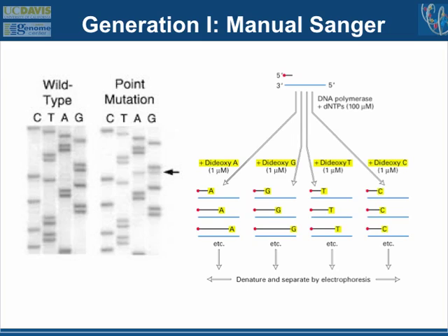And so you have these 4 different tubes, and each one of them will end up with pieces of DNA that stop at the point where there is an A in the A tube, in the newly replicated piece of DNA that the DNA polymerase is copying. And then you run these out on a gel, separate them by size, and you get this DNA ladder. And you can just read the ladder corresponding to the sequence from the original organism.